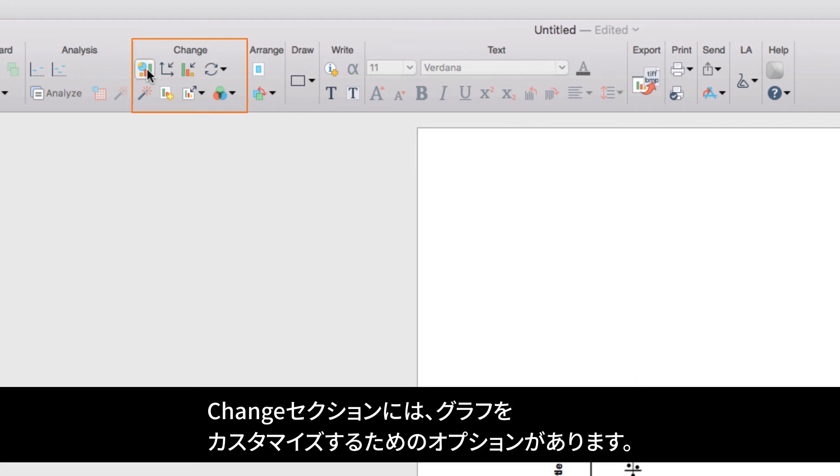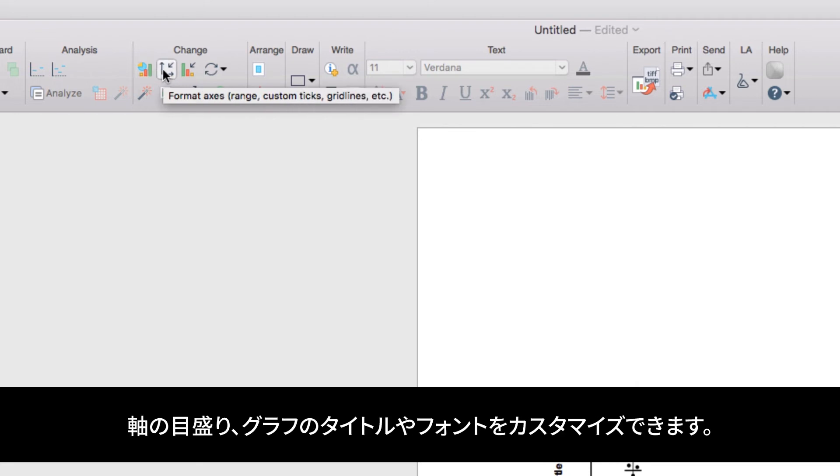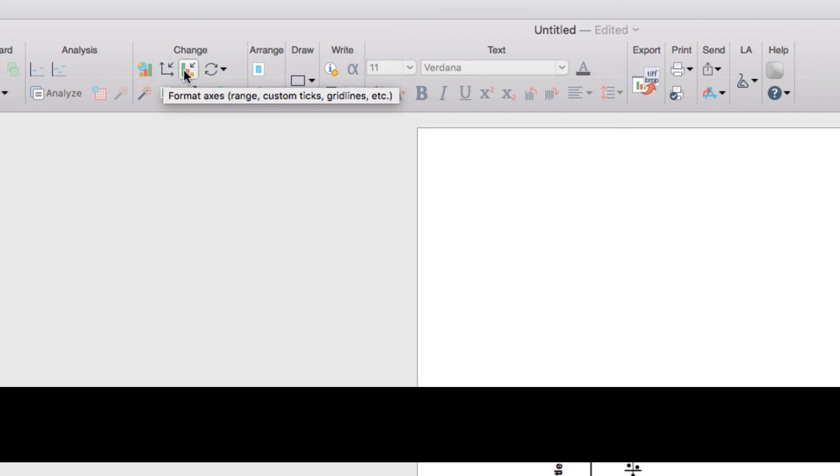Many other options for graph customization can also be found in the Change section of the toolbar, including the Format Axes dialog, which allows you to customize the axes as well as the frame and origin, grid lines on the graph, or customize tick marks as well as titles and fonts of your graph.